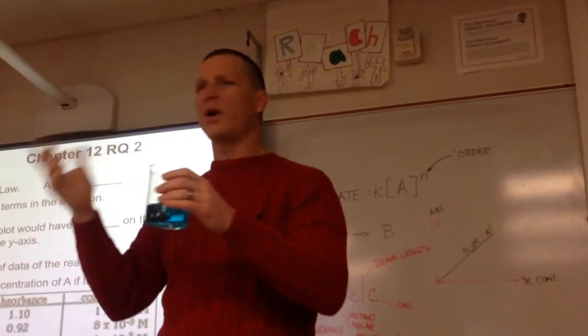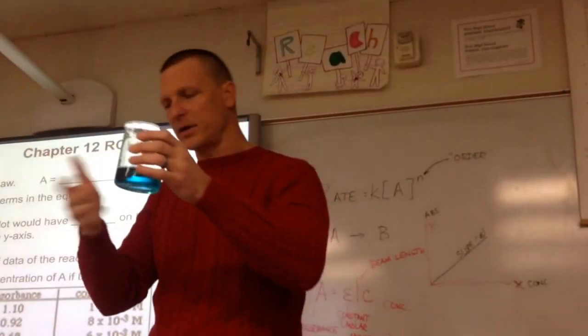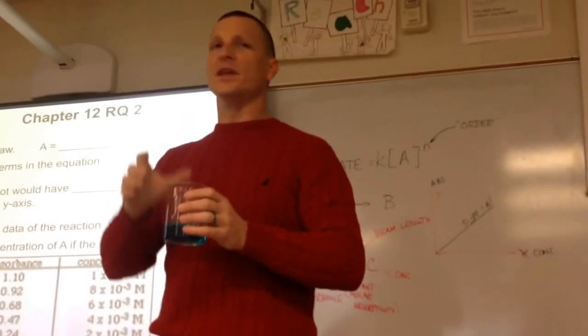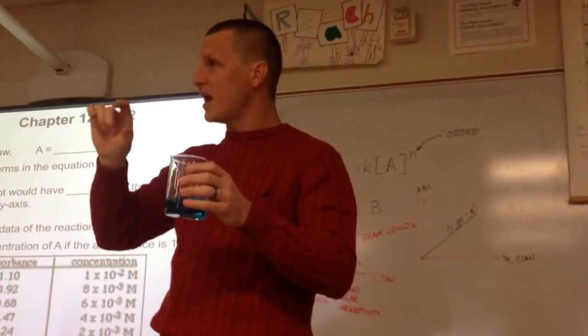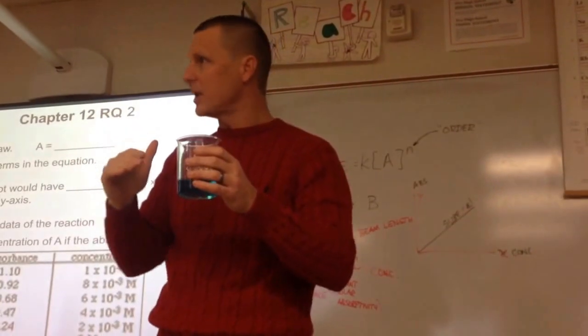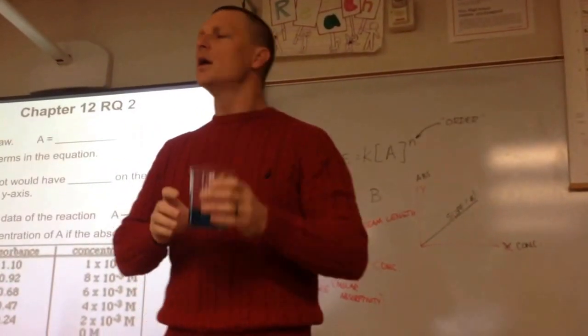But now, I wanted to do this early enough in the hour. Later on, I'm going to ask you to take a look at this. We're going to see definitely this thing is changing color. The spectrometer would be able to detect that better than our eyes can. So you're going to see the absorbance going down, down, down, down as the concentration of it changes.